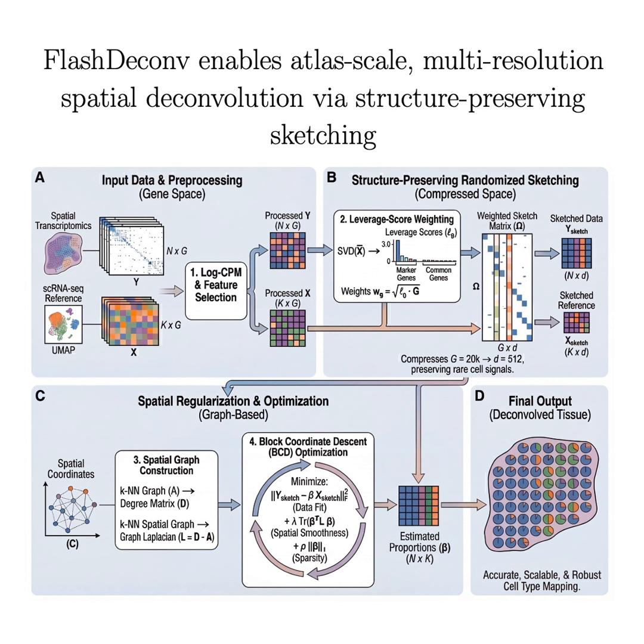It's a critical concept. They were analyzing mouse small intestine, and FlashDeconv processed over 350,000 spots at the highest, 8-micron resolution in just 12 seconds. Wow. And by systematically analyzing that same data across 5 different resolutions, they found this crucial transition zone, right between 8 and 16 microns. What defined that horizon? What happened there? Geometric mixing.